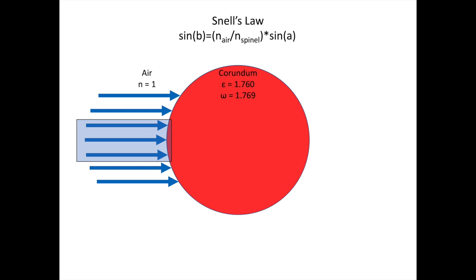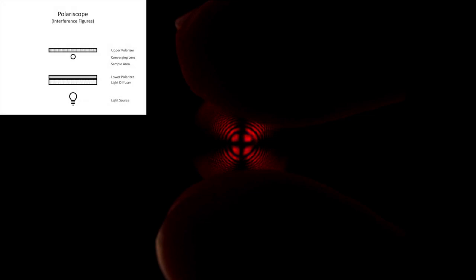Getting back to our corundum sphere with crossed polarizers — the reason we actually see an optic axis interference figure is that the corundum sphere itself is acting as a converging lens. No need to add a converging lens when the shape of your sample is already doing that job. This is one thing that makes the corundum sphere pretty cool. Seeing this optic axis interference figure tells us exactly the direction we're looking through the sphere: we're looking along the optic axis of our corundum, which means we're also looking along the c crystallographic axis. So crossed polarizers quickly help us orient our sphere in space.